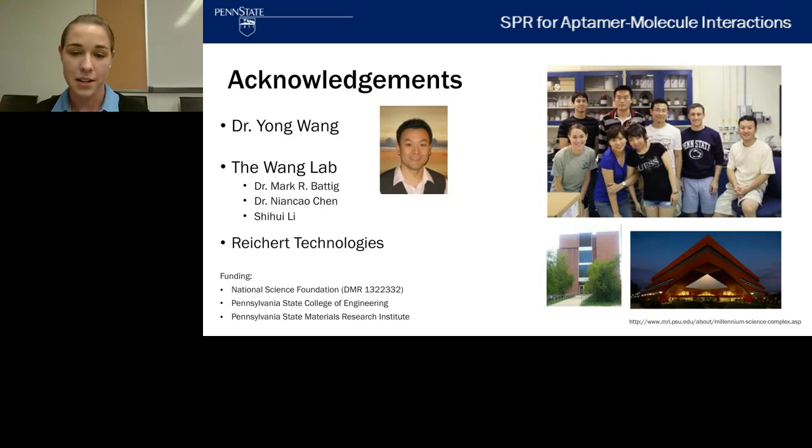I guess I would just like to say that SPR has been a great technique that our lab has used in many different types of studies, and we've gained a lot of quantitative information about the interactions between our oligonucleotide systems and their target molecules. But if this is the type of interaction you'd like to investigate, even if it's not with aptamers, I would highly recommend looking into using surface plasmon resonance to get a bit more of the binding interaction data in your systems. I think it's a very worthwhile technique to attempt for any biomolecular interactions.